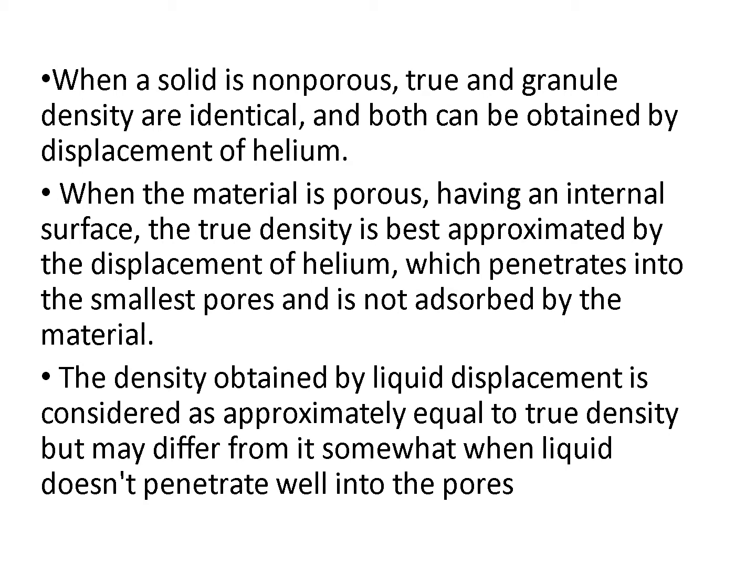So by adding our sample in the sample compartment and opening the gas chamber, the gas can enter and displace the inter and intravoidage, and the pressure is measured. Then this device, the helium pycnometer, will convert the pressure into the volume.